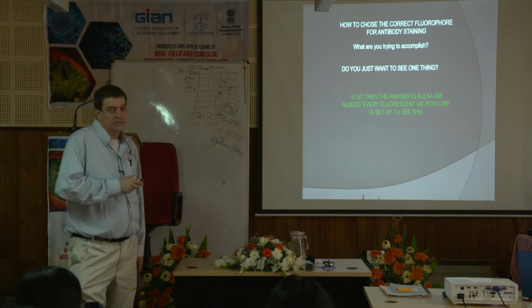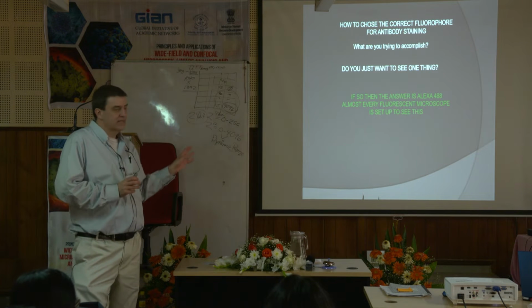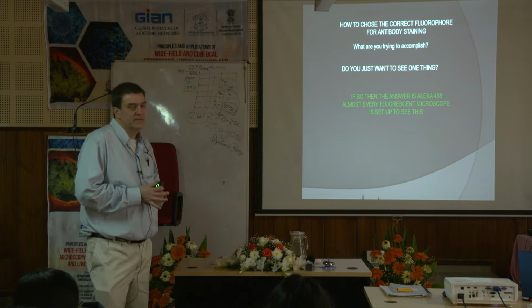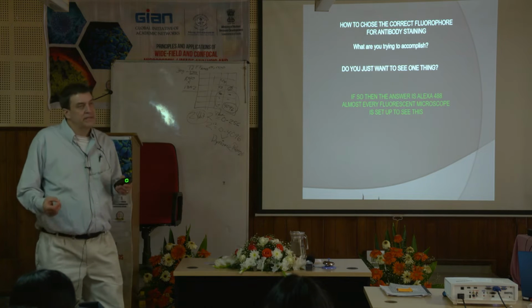Have the ability to see Alexa 488 because it's like the most common one that's just out there. I mean, FITC has been around forever. Alexa 488 is a real popular dye. Green is usually your best color to work with. Not to mention your eyes, being from the Department of Ophthalmology, your eyes see green better than any other color also. So green, I like it.